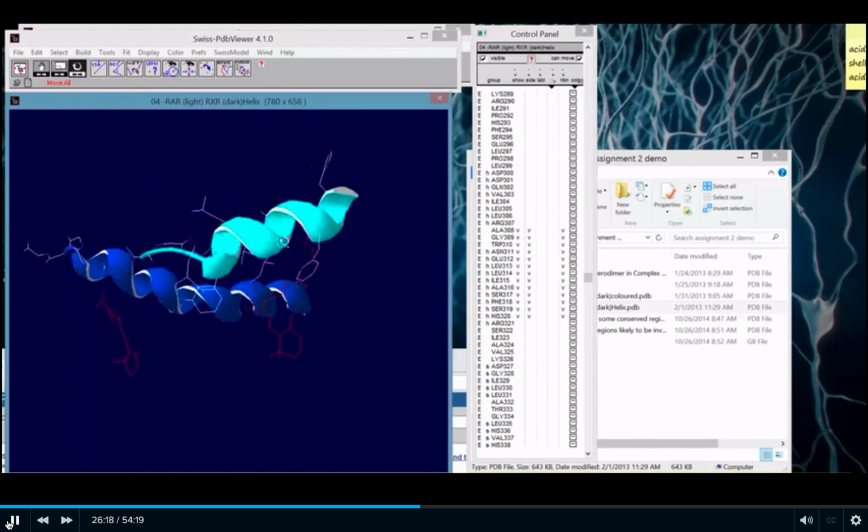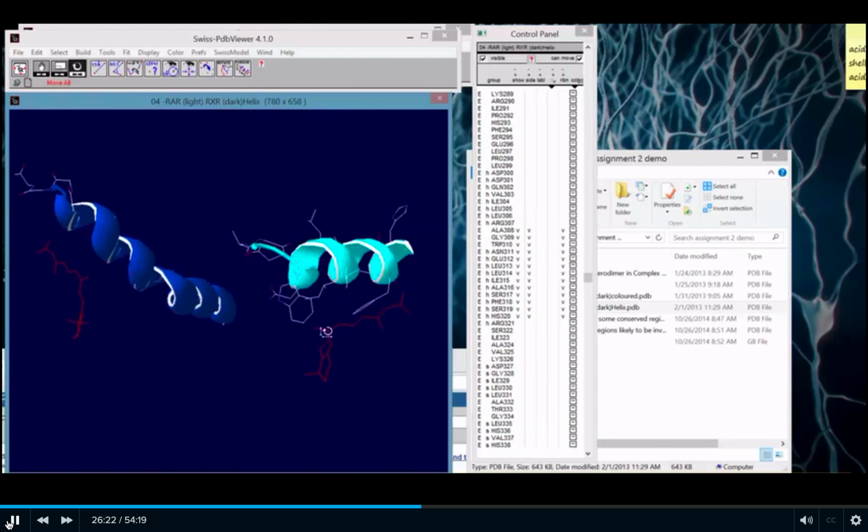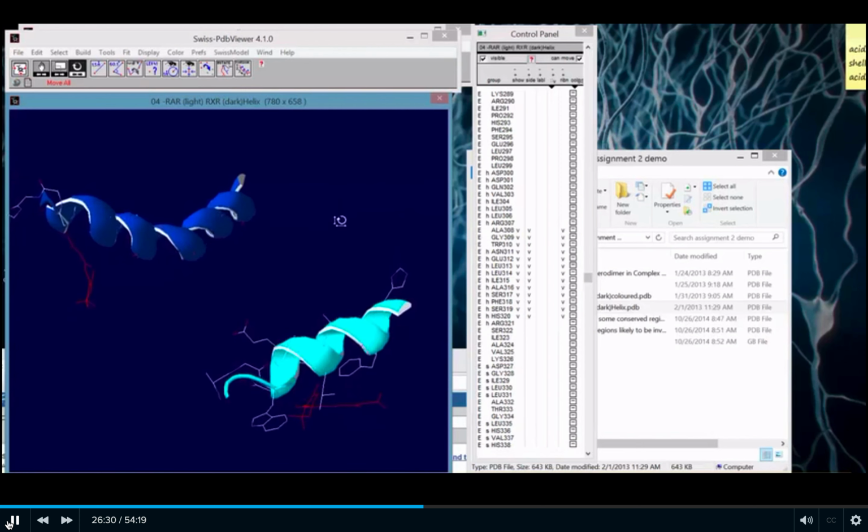So it actually fits in between, right? Here's that kink, imagine it going straight out. Right where my mouse is, if you almost put your finger on the monitor, as I rotate this down, right about this alignment, that should be coming straight out at you. So in a sense, it's actually sandwiched between these two residues.